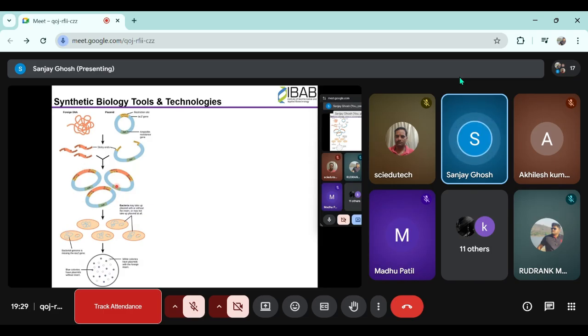You make a recombinant plasmid which has a selection marker, and that is important. Why is the selection marker needed? Because you need to know, after you put it in an E. coli, which E. coli has received the plasmid. If you are not able to do that, then there is no way of knowing which cell has received it and which has not. And why is this important? Because no technology or method is 100%. So even if you transform and give a heat shock, most of your cells would not have received the plasmid, only a few. And to know which few, you need these so-called selection markers.